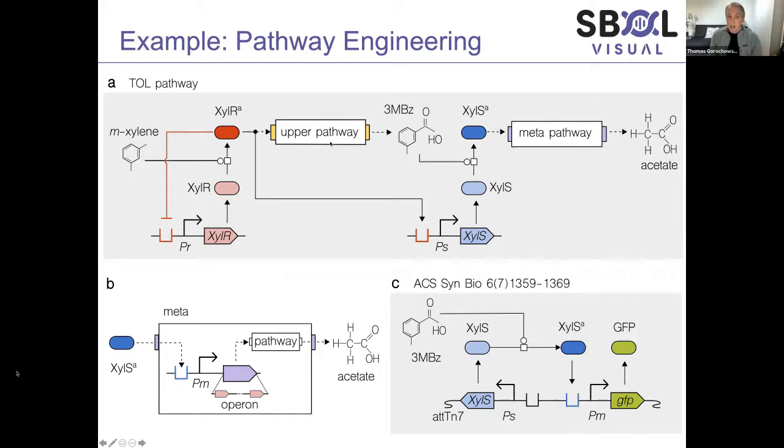And if you use this effectively, it means you can really help a reader understand precisely what it is you're trying to communicate, and they don't get confused by all this other stuff that's going on, which isn't that relevant for the point you're trying to get across. And you can see that down here as well, where in this case, this meta box has been expanded internally, so you can see how it's functioning. And this also shows the expansion symbol I showed you. So you can have an element which you can then expand out to show that this represents something more complicated internally.